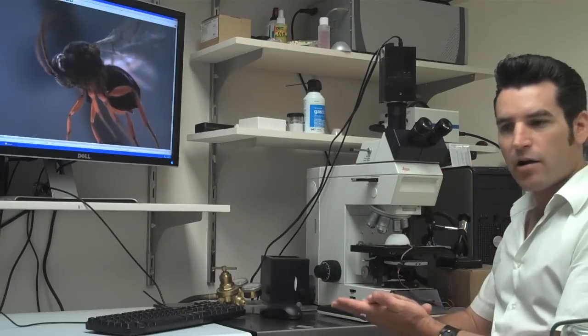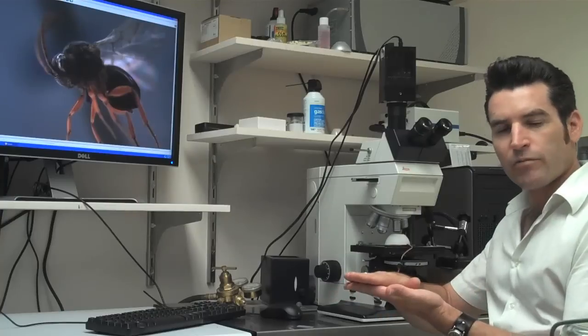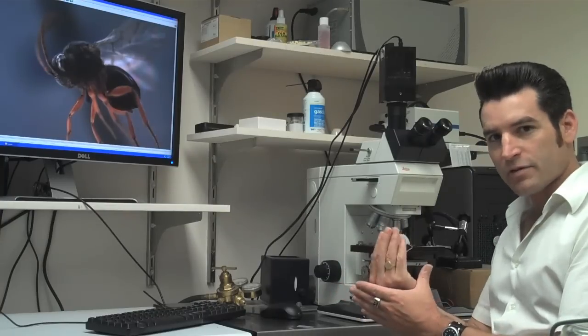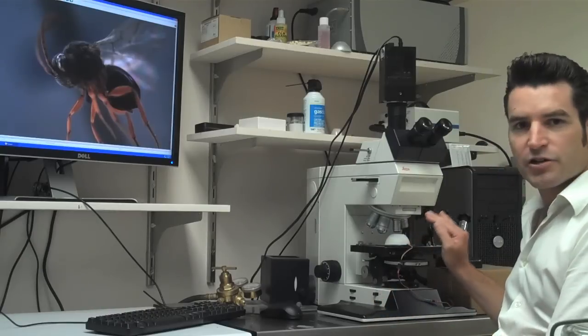Something that's been prepared and mounted and put underneath a cover slip with some sort of adhesive, and you transmit light through the specimen. That's what these lenses are engineered to do.